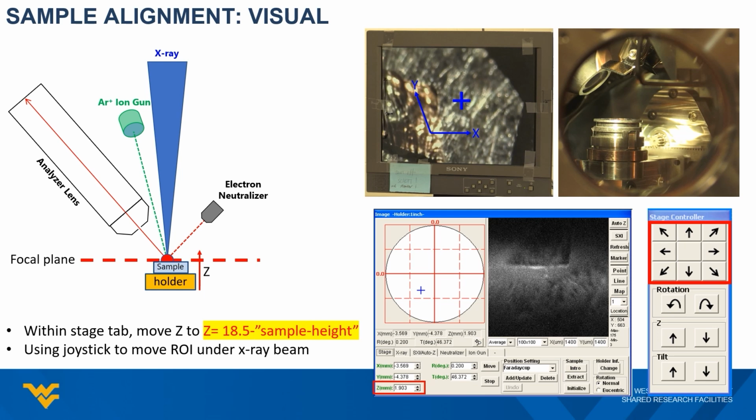To observe the sample during the alignment, a telescope is installed from the back of the system, which is also focused on the same spot. An image could be seen from a monitor which locates right on top of the computer monitors.